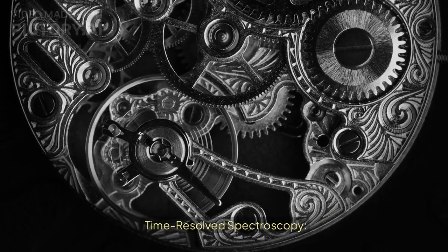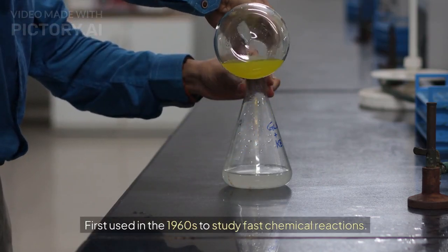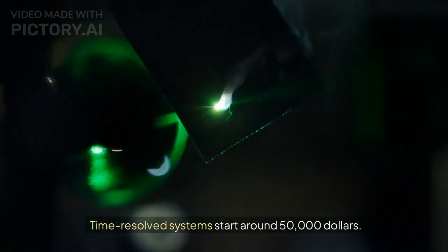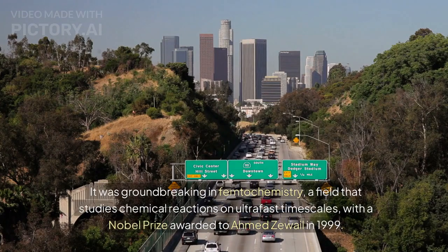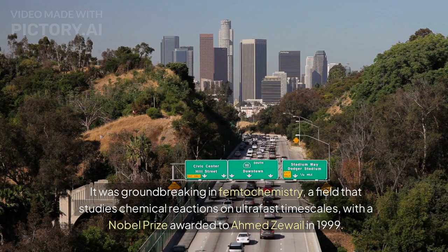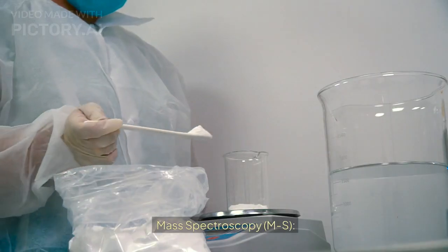Time-resolved spectroscopy. First used in the 1960s to study fast chemical reactions. Time-resolved systems start around $50,000. It was groundbreaking in femtochemistry, a field that studies chemical reactions on ultrafast timescales, with a Nobel Prize awarded to Ahmed Zewail in 1999.